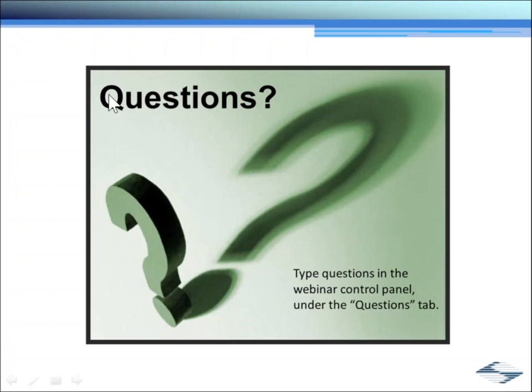Okay, so this next question is, can I ask where the scanning mirror is located in the MOM, and is a galvo mirror or resonance scanner integrated into the MOM? So I pointed out on the slide, and we can go back to it, showing where the scanning is. I'm not quite sure what they want to know. Maybe they can offer a little bit of clarification on the question.